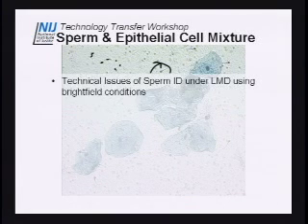There are some newer slides that are coming out that we're hoping, and we have some actually here that just started being available maybe in May that we're going to test that are much clearer. And oddly enough, those pores have been purposely put in there because the original manufacturing of the pen film wasn't designed for laser microdissection. It was designed, I believe, for audio video technology, which they wanted the pores put in. So there hasn't been that evolution of making this product exclusively for laser microdissection.